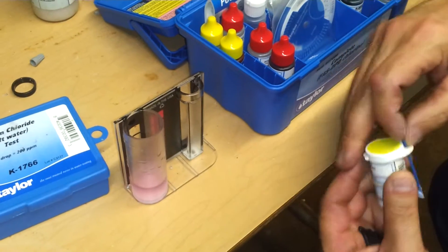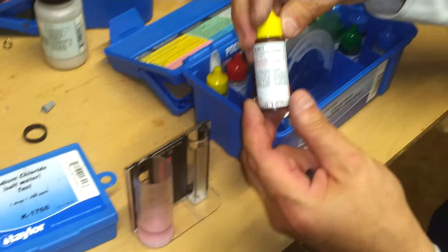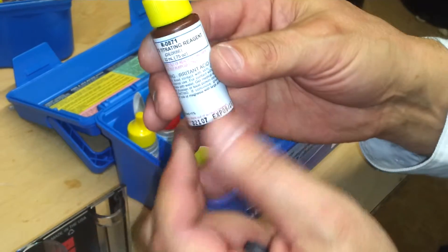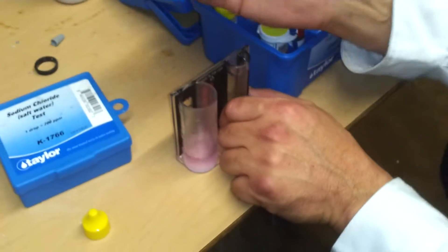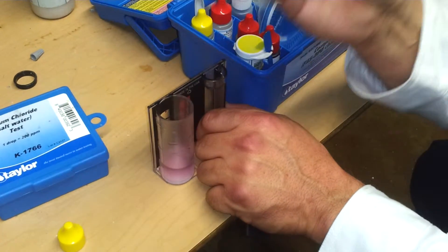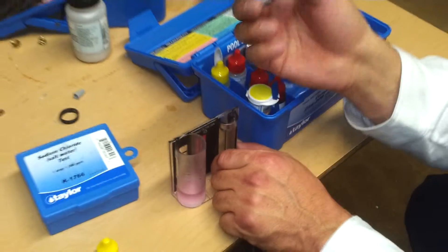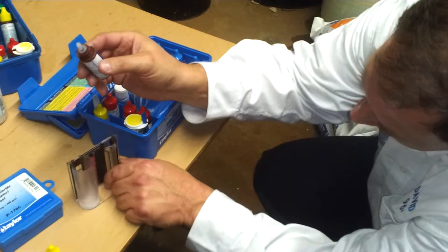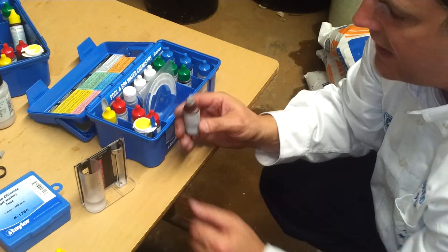Now that we see there's pink — or chlorine — in there, we need to know how much. So we take the FAS-DPD titrating reagent, brown bottle, and we add drops — one drop is one-half part per million, so two drops is one part per million. It turns at half a part per million at a time. We take one drop, add it in, and we're waiting for it to turn clear.